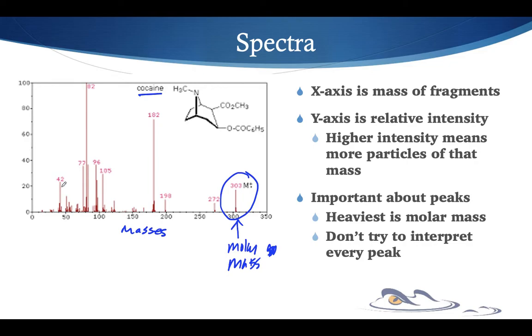And we generally try to look at the really big peaks, the ones that are generally big. However, a trained person who can look at these, and they are very specialized people, organic chemists, can interpret these and make sense out of a lot of the peaks. And you have isotopes that play an effect with this. You have recombining of particles after it's been fragmented, that plays a part in this. There's a bunch of math that goes along with how many of these little fragments are going to show up. And so it is very complicated.